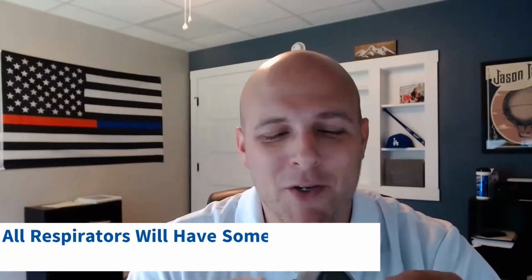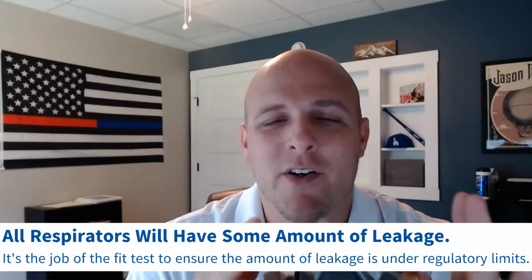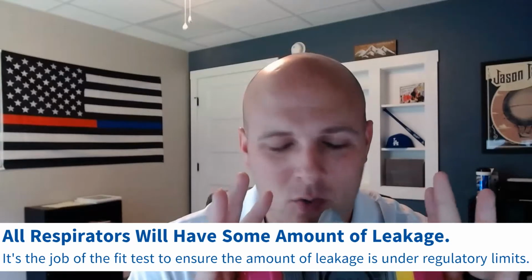an acceptable amount of leakage, which brings us to our next point: okay, I've got this respirator, I've done a fit test, it's passed. That means there's no leakage, right? Not quite. So I'll go on air, you can quote me, whatever you want to do: every respirator will have leakage. No matter what type of respirator it is, no matter who you are, there will always be leakage. What these fit tests are doing is making sure that your leakage is at an acceptable rate.